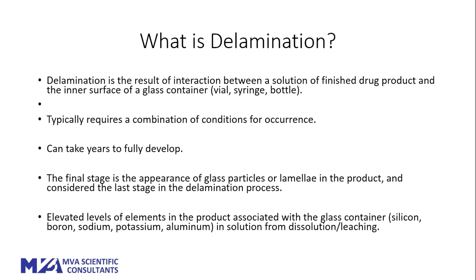Delamination is often not seen until a product is well into the development stage or beyond. The final stage is the presence of glass particulate in the product. Another useful measure is the amount of elements associated with glass containers — measuring their levels in the product gives a sense of how much glass has made its way into the product and off of the container.